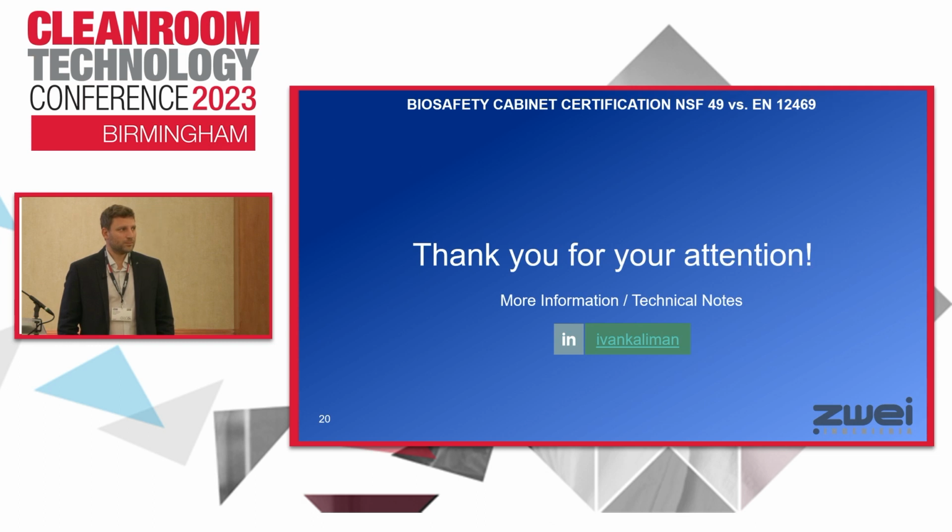But that's interesting and new information that you've shared, showing that some of the mechanical and aerodynamic performance of the safety cabinet may lead to sample contamination or, at worst, personnel contamination or environmental contamination. That's the whole purpose of the biosafety cabinet: protecting people, product, and the environment. Interesting data that you're sharing.